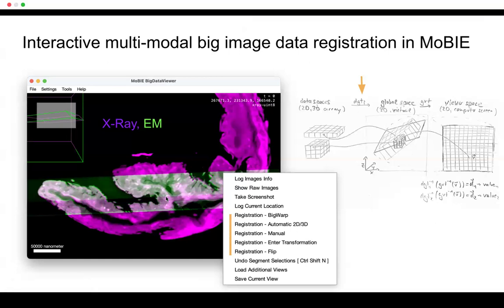And actually the example I show here is also quite beautiful, I think. So this is actually in magenta. Here is an x-ray volume image of a sample. And then we got this sample and cut parts of it and imaged it in slice-based EM. And then we used all this functionality to register then back the EM into the x-ray. And you see how it really beautifully overlaps now. It's a little bit of work because actually the EM seems like it introduces a bunch of deformations. So we use the x-ray here. We think the x-ray is the ground truth and we registered the EM into the x-ray, but happy to discuss more about this.